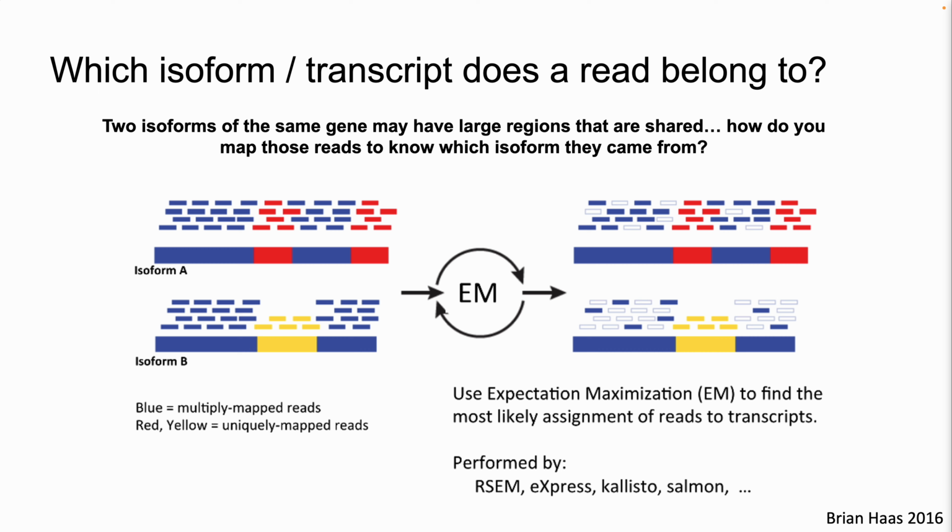So what this is doing, the cartoon is meant to show, is you've taken the average of the red depth and the yellow depth and made the blue depth be about the same as the red and the yellow. Does that make some sense, I hope?